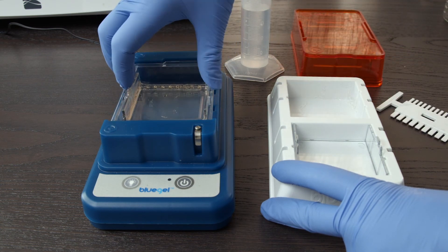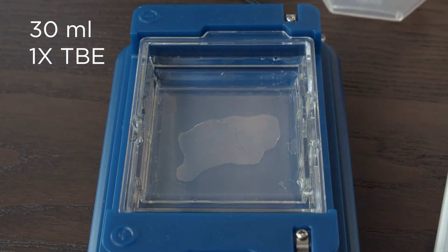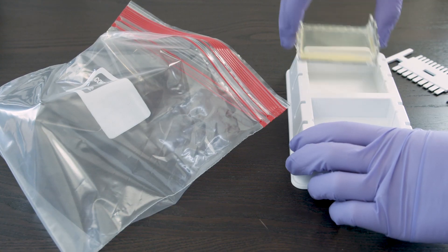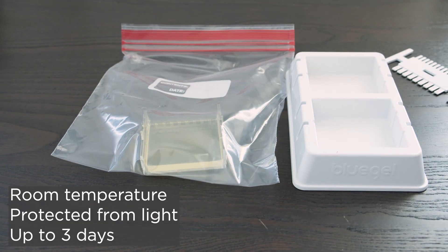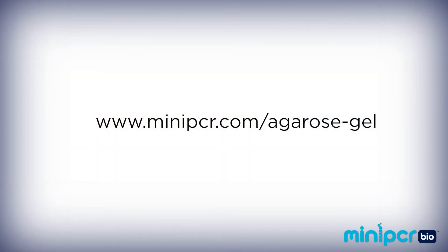You will need an additional 30 milliliters of 1x TBE running buffer for each gel that you want to run. If you want to store your gels to run at a later time, you can prepare gels up to three days in advance. Wrap your prepared gels in plastic wrap or place them in a sealed plastic bag and store them at room temperature, protected from the light. Gels should not be stored submerged in buffer. To learn more about all-in-one agarose tabs and other gel electrophoresis supplies, you can visit miniPCR.com.